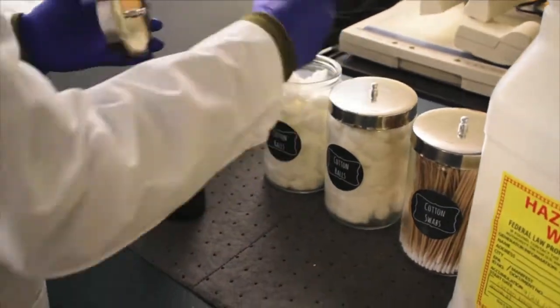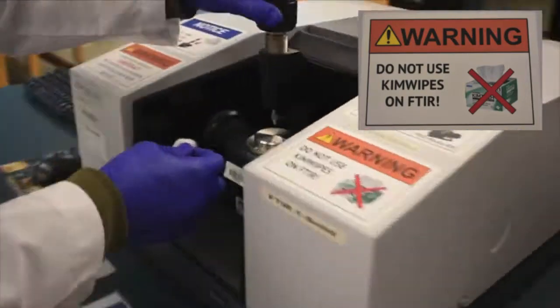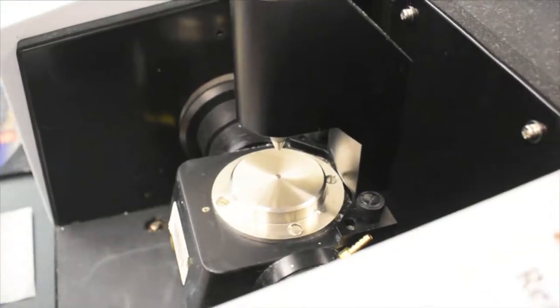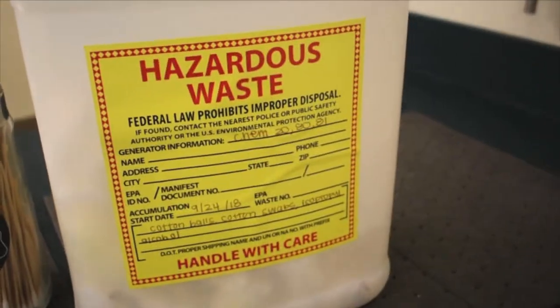Before scanning your samples, you'll need to clean the IR machine. Use the cotton ball along with some alcohol to clean the loading tray. Dispose of the cotton ball into the hazardous waste container. Wait a few seconds for the alcohol to dry before loading your samples. You'll need to repeat this process for every new sample.